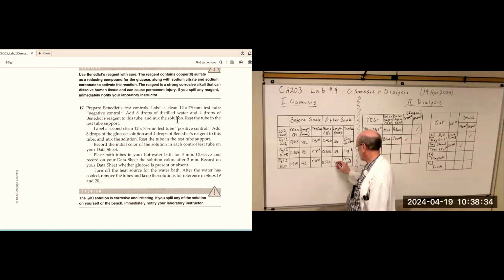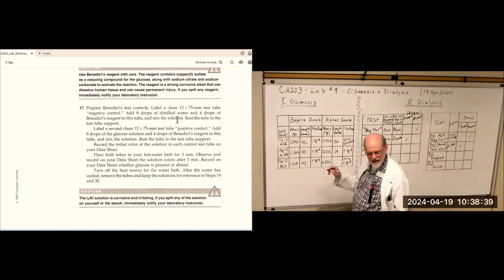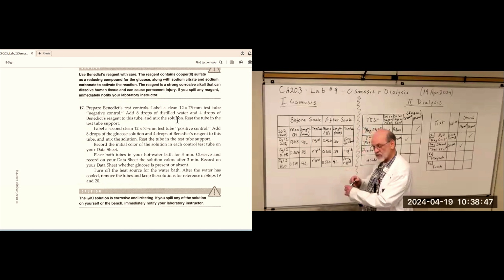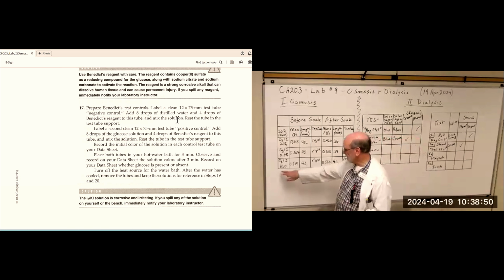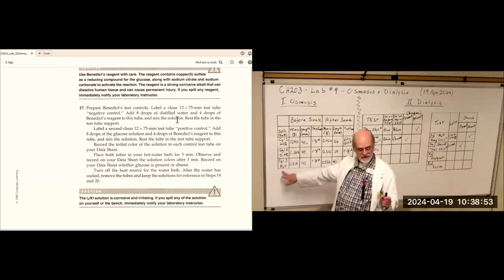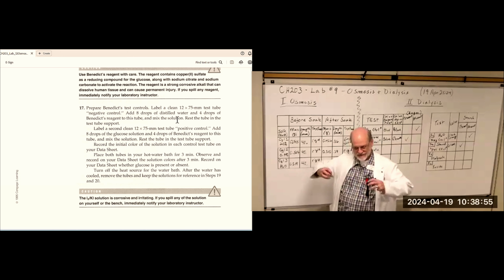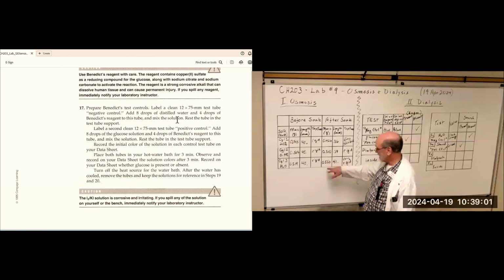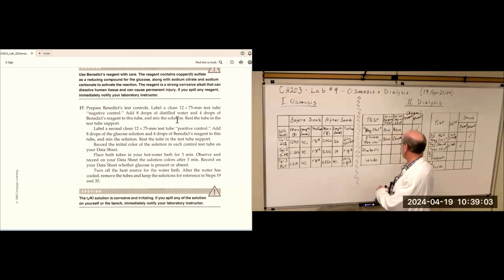I assume this wasn't a perfect cut because it looks like it grew. Yeah, that's fine. How big is it? That's 41. Okay. Actually, that's what we expect, right? Because which way is the water going to move? Into the cells. That made it more rigid, and it made it longer, and heavier too. Okay, now we go to the next ones. We're past 20 minutes.